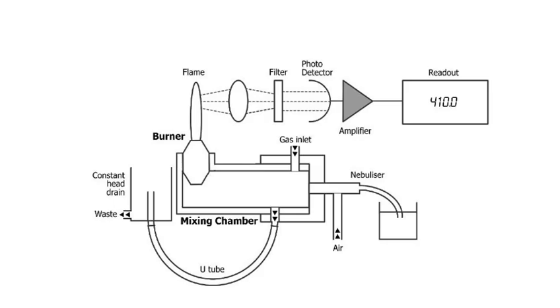So this here is a schematic diagram of the flame photometer.